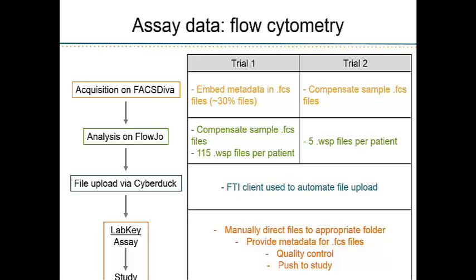And when I say a lot, I mean relative to our group rather than maybe the teams that you guys have here. Our second trial, we got quite a bit smarter and decided to compensate these files within FACSDiva, which meant that we can incorporate every single sample from a certain patient into one file per panel, drastically decreasing our output. And then both of these are uploaded in the same way, and then they still have to be organized in the same way.